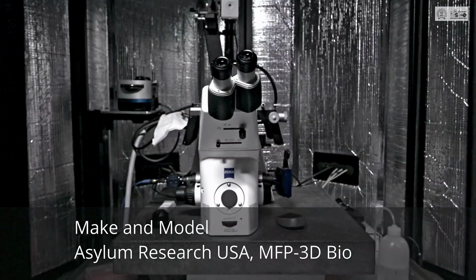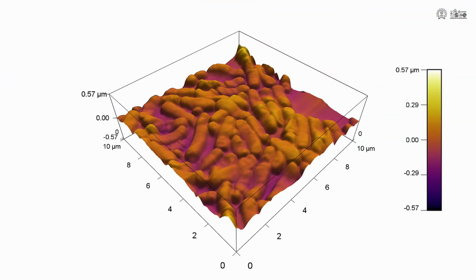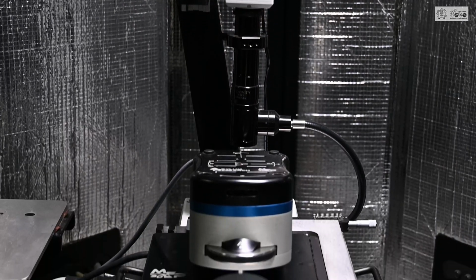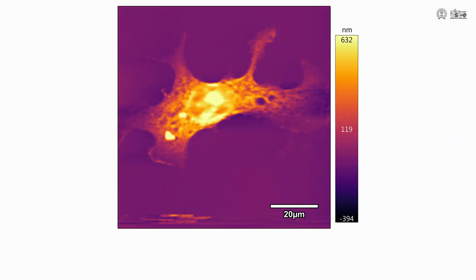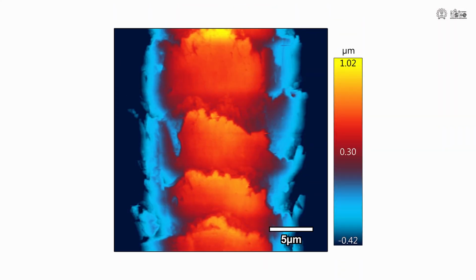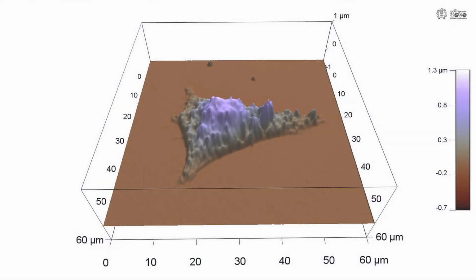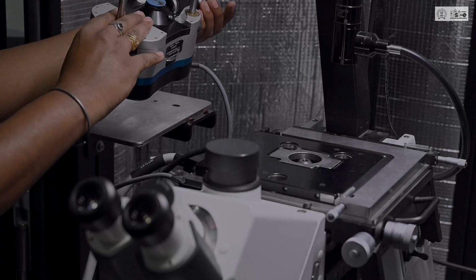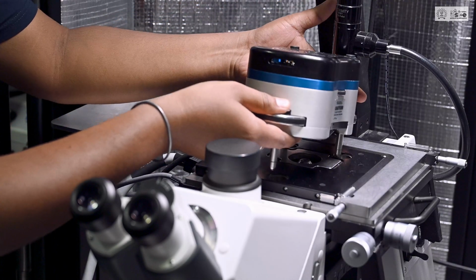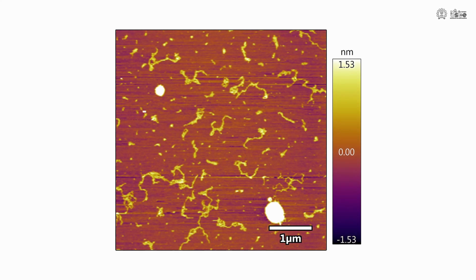The atomic force microscope, or AFM, can be used for topographical imaging of samples. The AFM at BSBE can handle soft and wet samples, that is, biological cells and tissues, and hence it is called a bio-AFM. One can measure topography, morphology, and mechanical and electrical properties of cells and tissues. Pre-processing of samples is not required while using the bio-AFM, and hence it can be used to study live cells.